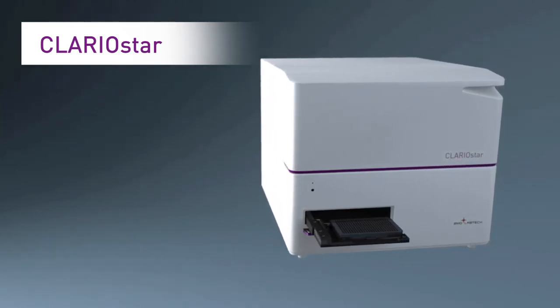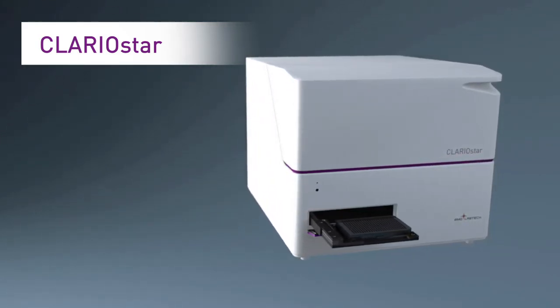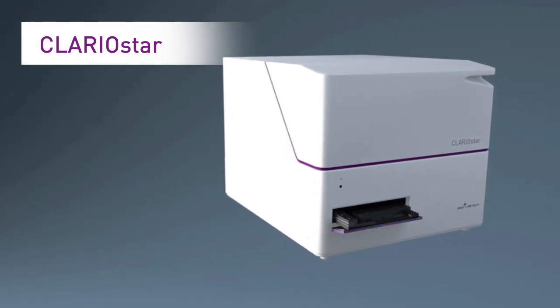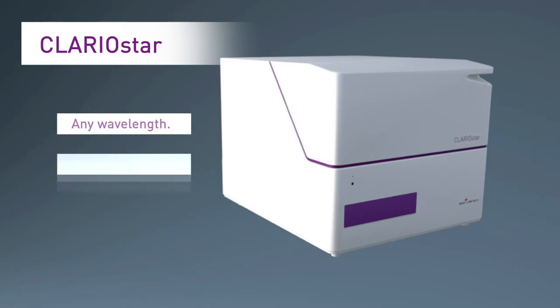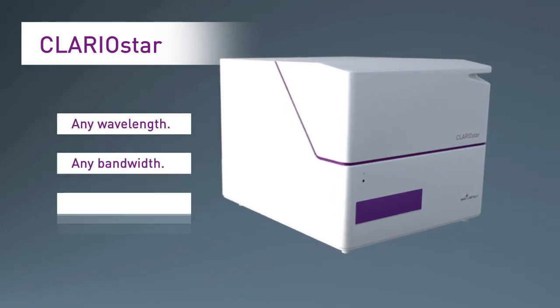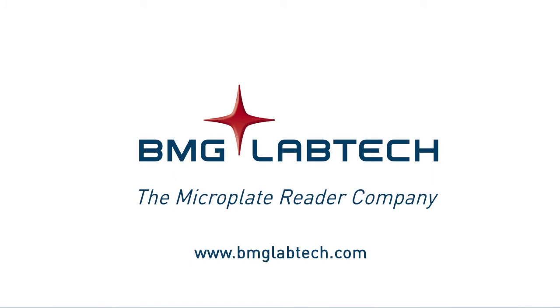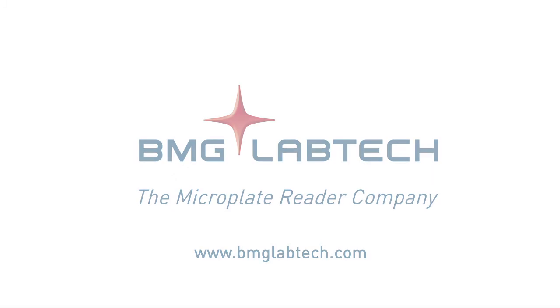Contact BMG Labtech today to learn how the Clariostar can take your research to the next level. With the Clariostar, anything is possible — any wavelength, any bandwidth, any assay. Clariostar: anything is possible.